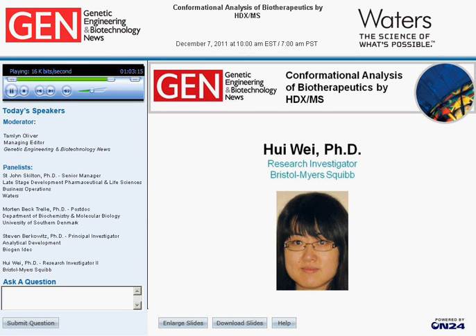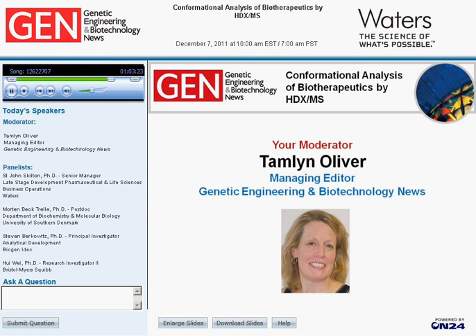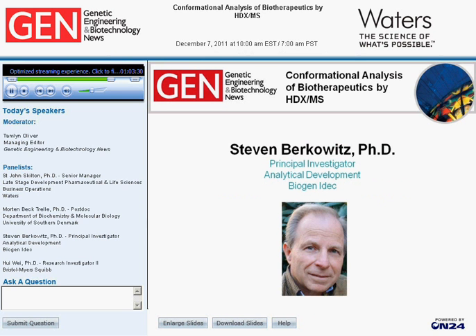Stephen, how much has the automated software cut down the time of analysis? Well, that very significantly. I think if you go back a few years, you would take on the order of maybe a month or two to process a lot of this data. The advances that have occurred up to now can bring it well within a week's time and even faster.